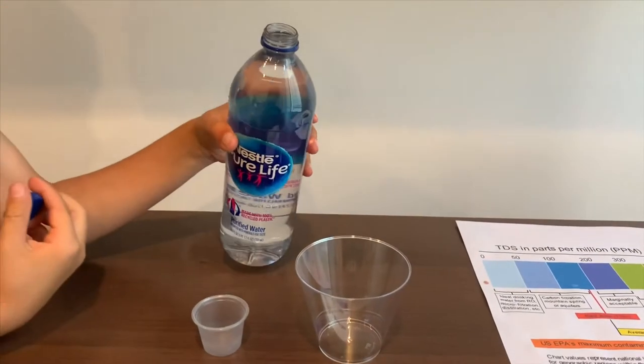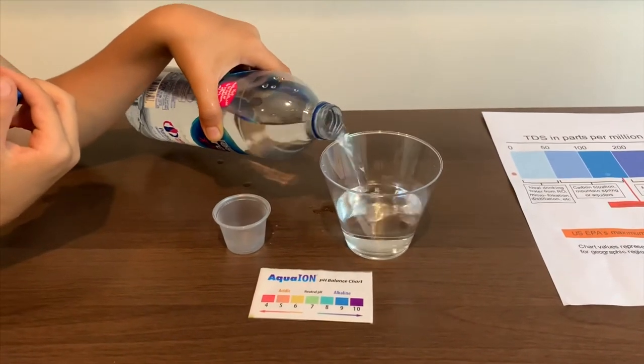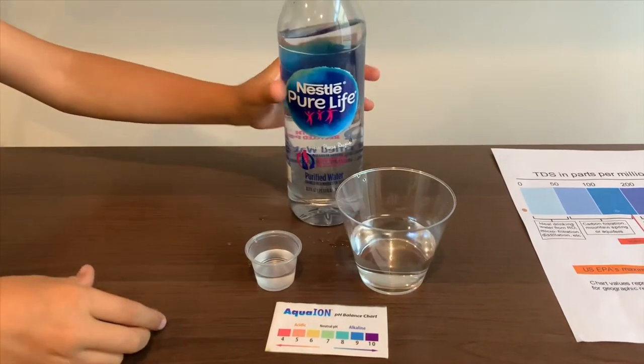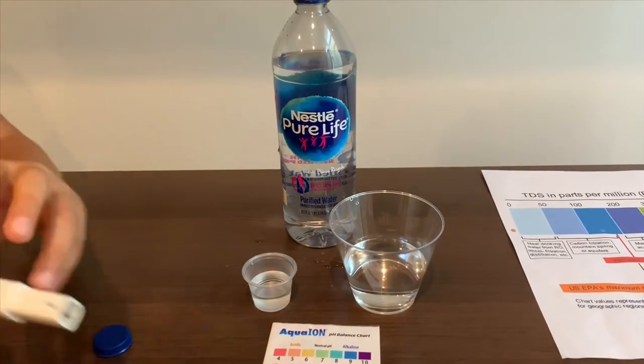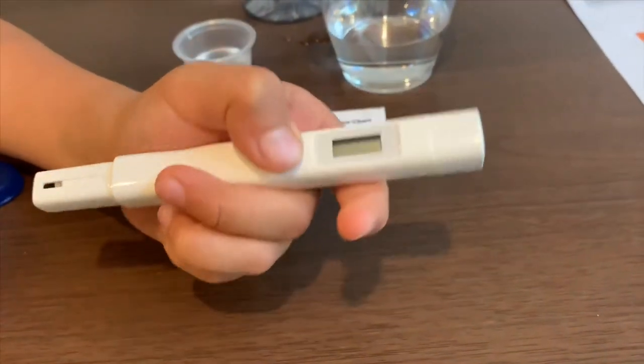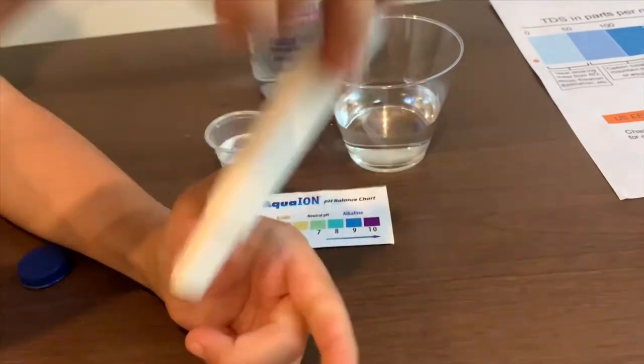Let's pour some water in. First let's test the TDS level. If you want to buy this TDS tester, check the link down below. Turn on the TDS tester, make sure it says 0 and put it in.